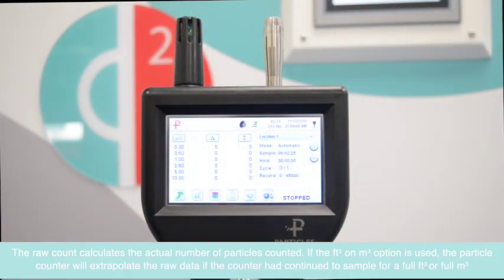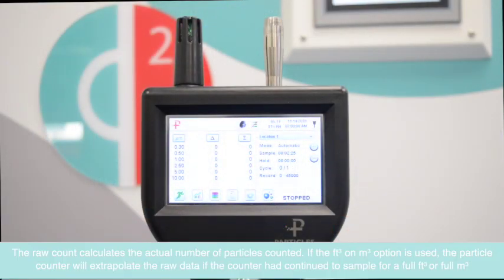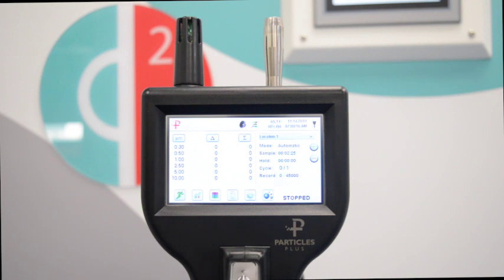First we need to get the particle counter in the right position. It should be positioned at working plane so you are getting accurate readings while the process is taking place. We're using a tripod to keep the height consistent.